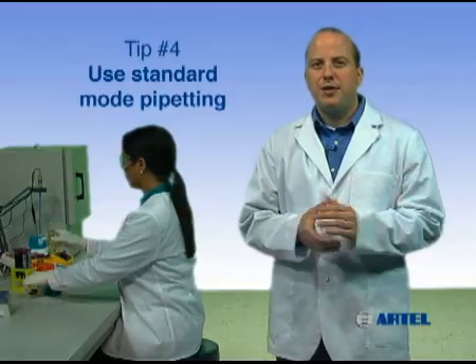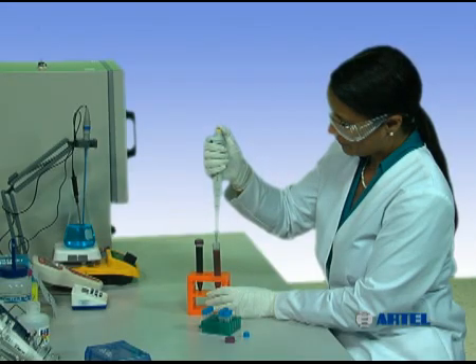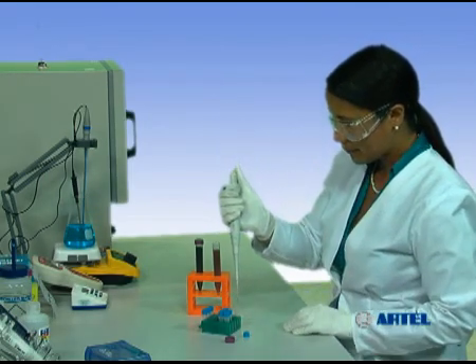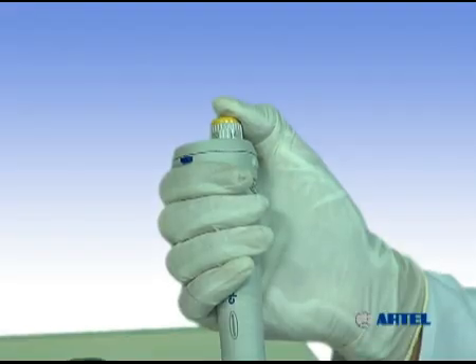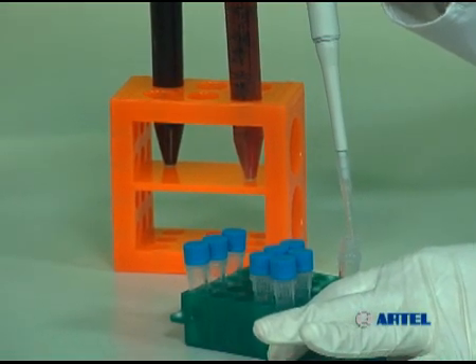When using standard mode, depress the plunger to the first stop. Immerse the tip into the sample and aspirate by releasing the plunger. Move the pipet to the transfer container and press the plunger to the first stop. Continue to press the plunger to the second stop to dispense any remaining solution in the tip.